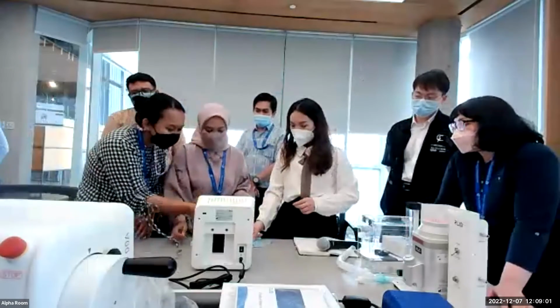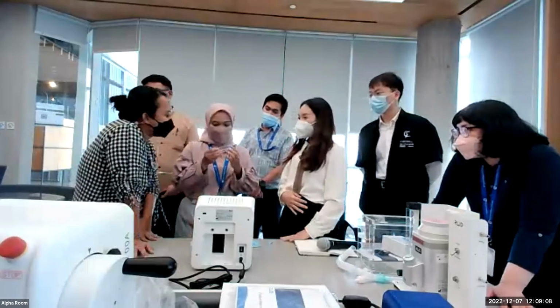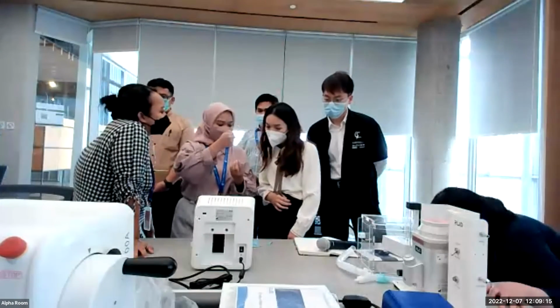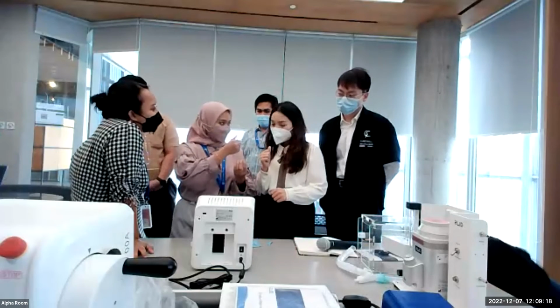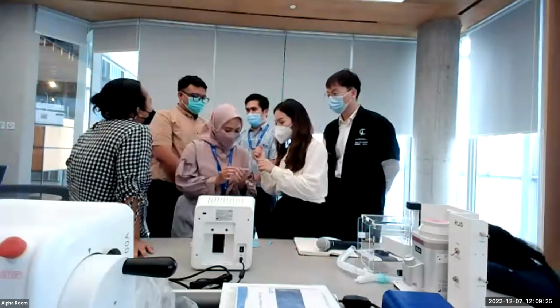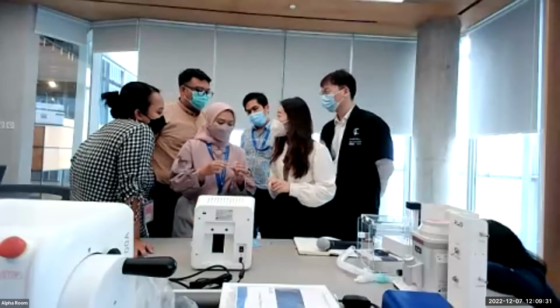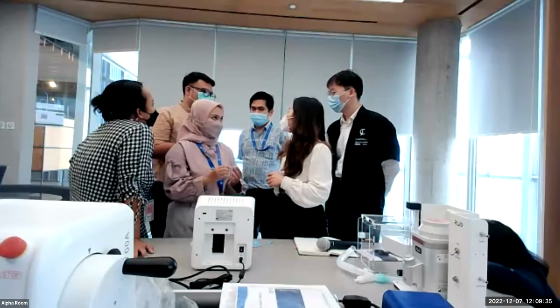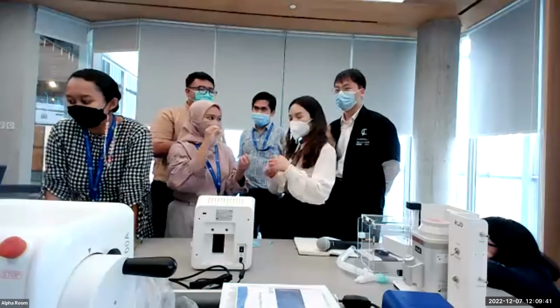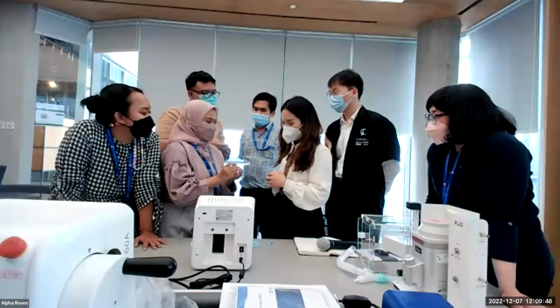The question now is about the machine: will there be bubbles? If there are bubbles, what then? How can we remove the bubbles from the cells, from the pipetting? We use a pipette and put the cells right here. If we produce a bubble inside, because when we pipette sometimes we produce air bubbles, can the instrument still count?